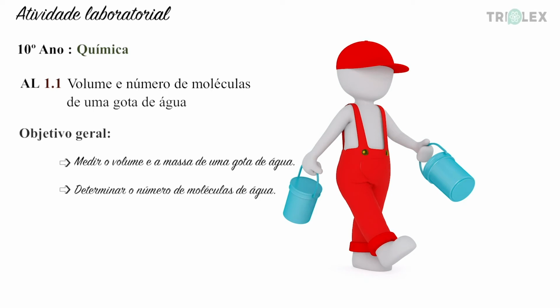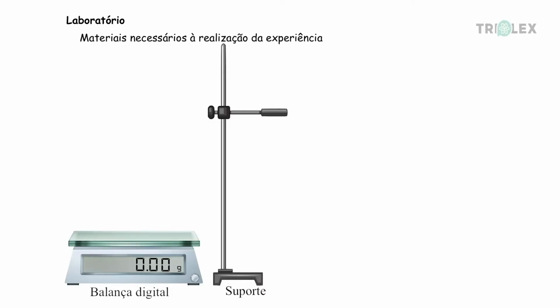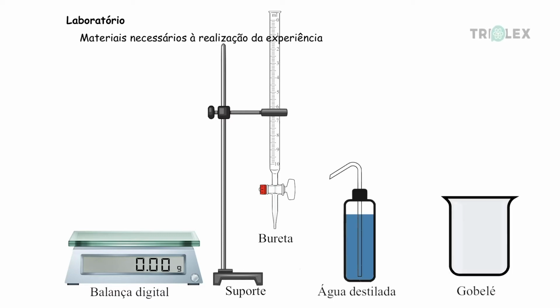In this video, we will calculate the volume and the number of molecules there are in a drop of water. For this experiment, the following material is needed: a digital balance, a stand, a burette, distilled water, and a beaker.